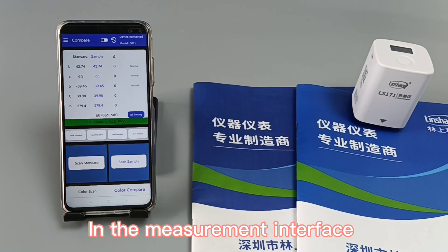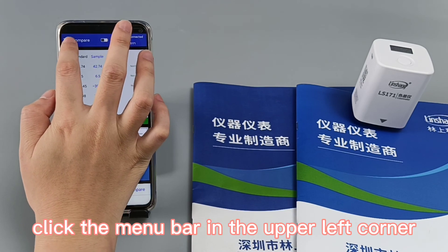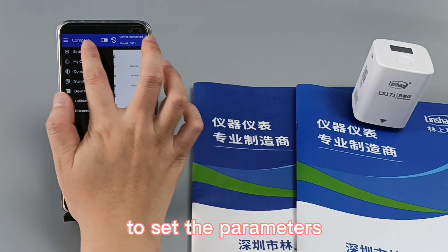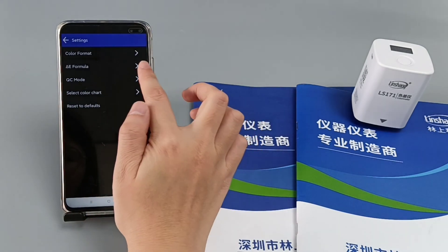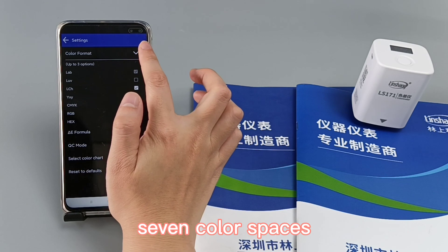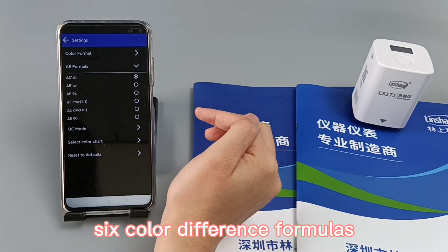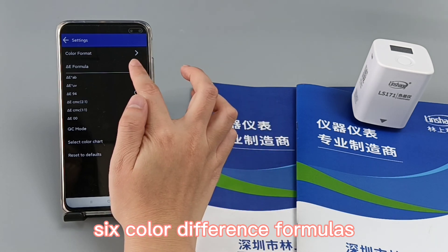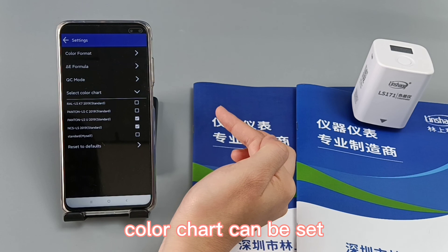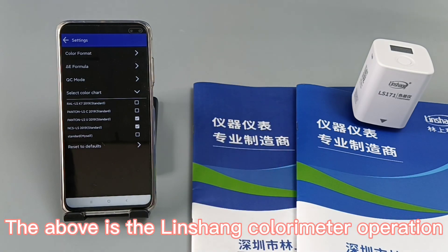In the measurement interface, click the menu button, then click the menu bar in the upper left corner to set the parameters: seven color spaces, six color difference formulas, QC mode, and color chart can all be set. This concludes the Linshan colorimeter operation demonstration.